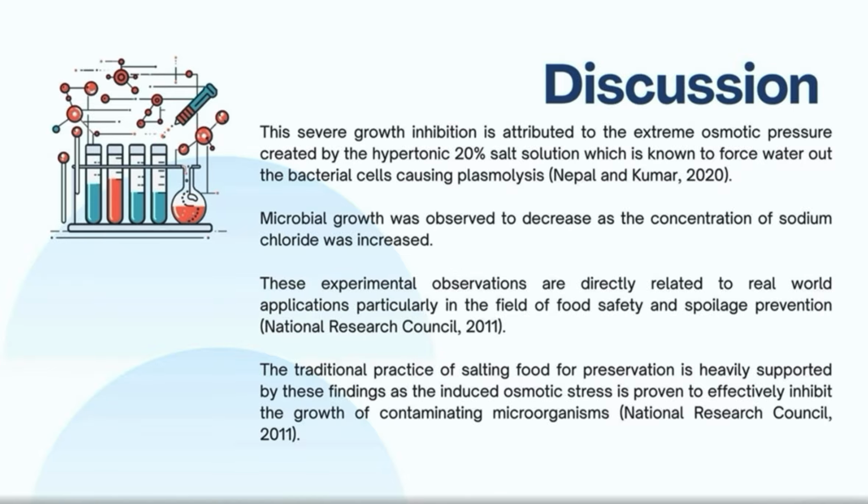Microbial growth was observed to decrease as the concentration of sodium chloride was increased. These experimental observations are directly related to real-world application, particularly in the field of food safety and spoilage prevention. The traditional practice of salting food for preservation is heavily supported by this finding, as the induced osmotic stress is proven to effectively inhibit the growth of contaminating microorganisms.